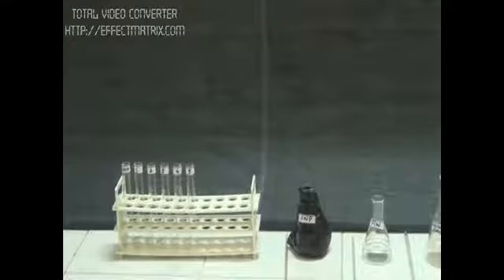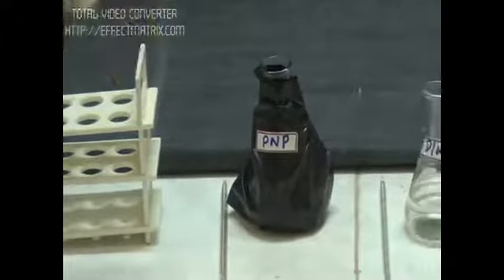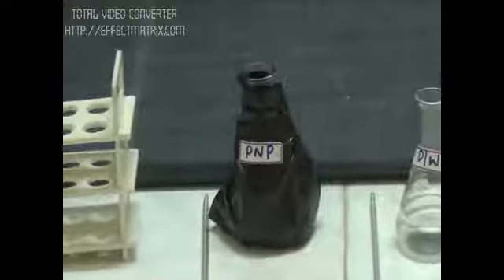We are going to perform the practical to prepare the standard graph. We have to use PNP, para-nitrophenol, which is a light-sensitive reagent, so we have kept it wrapped in black paper. Then we will use distilled water, acetate buffer, and 0.1 N NaOH solution.